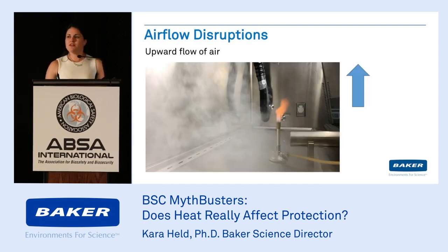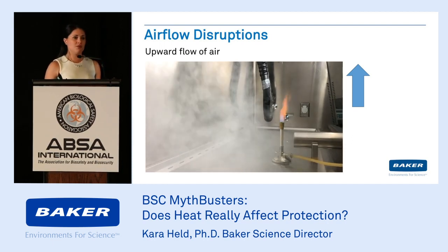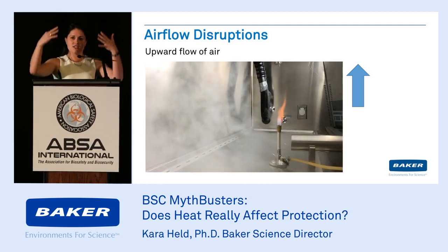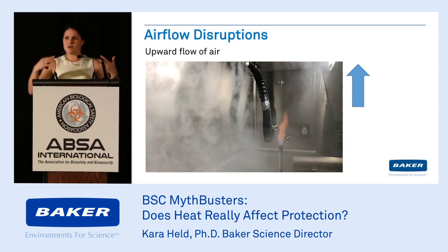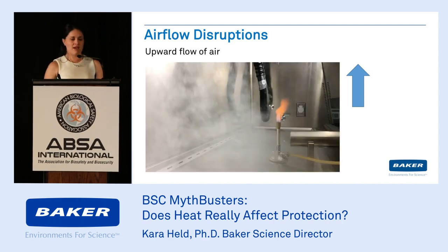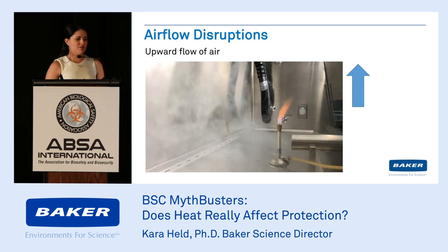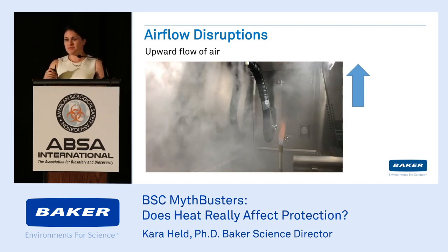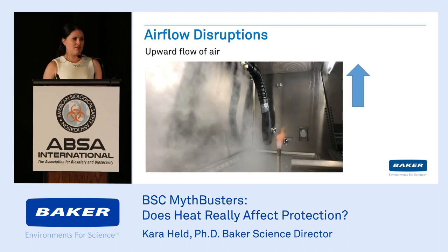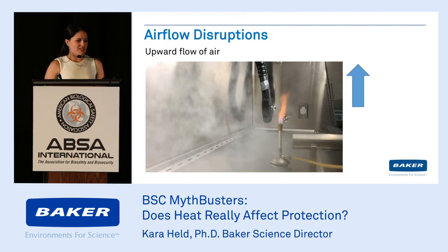All right. So now to look at it visually, we took theatrical smoke and put it through a long tube that has a lot of pinholes in it. So you have a nice curtain of smoke coming down. And you should be able to see a nice downward flow curtain across the back of the cabinet. But if you put a Bunsen burner in there, you can see from this movie a huge inward, upward flow of air. Air should never, ever move up in a biosafety cabinet. And this is just terrible.